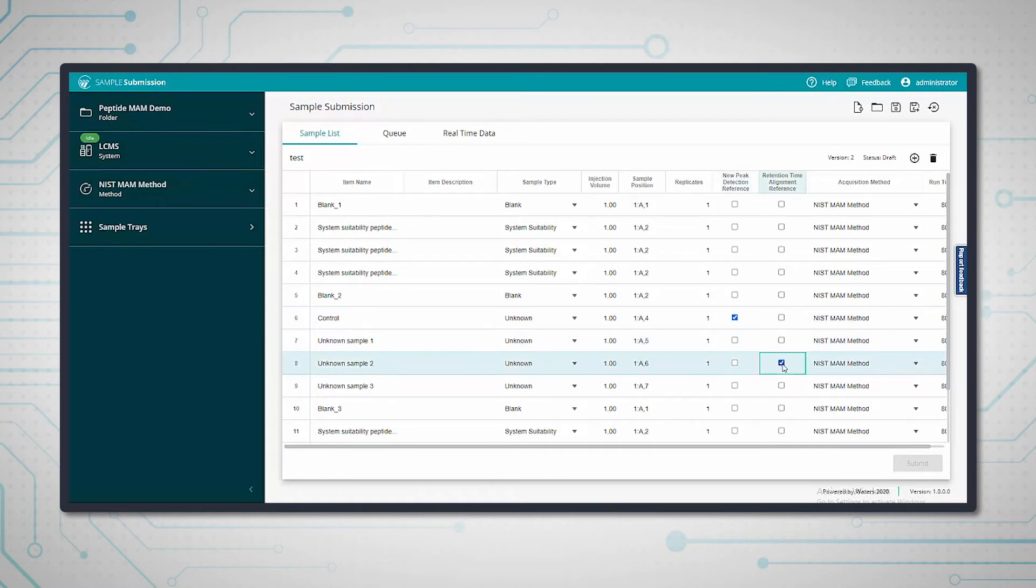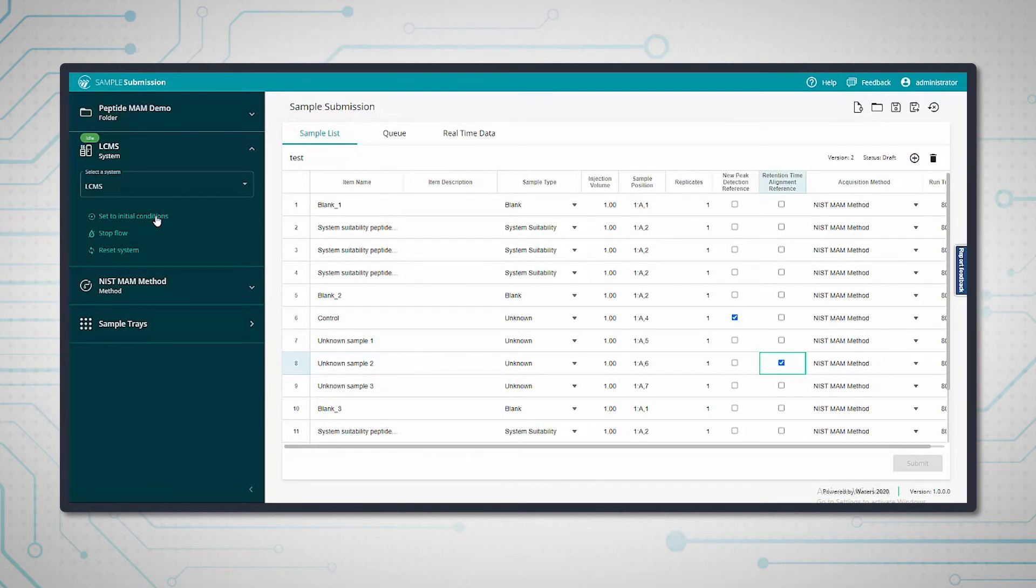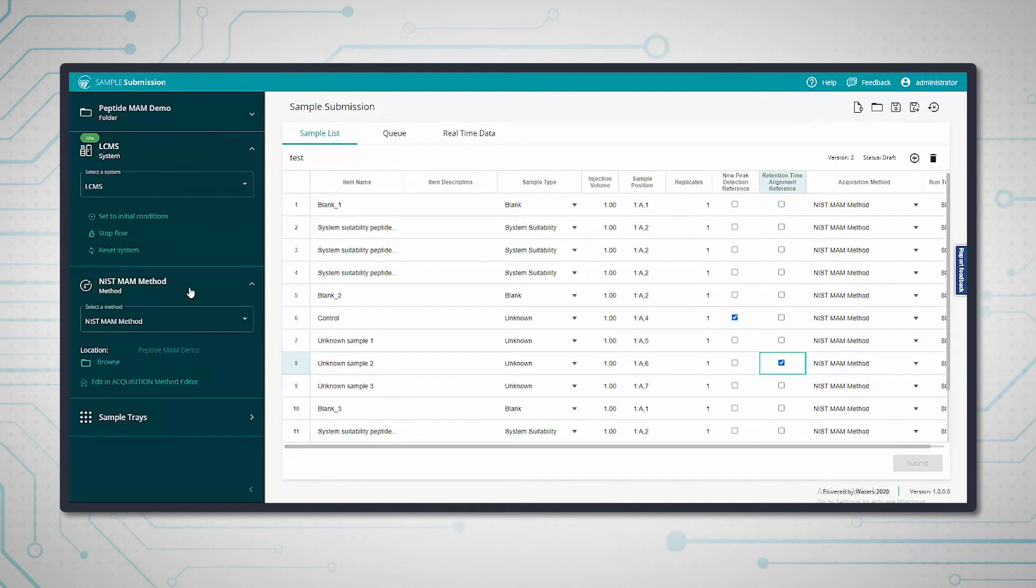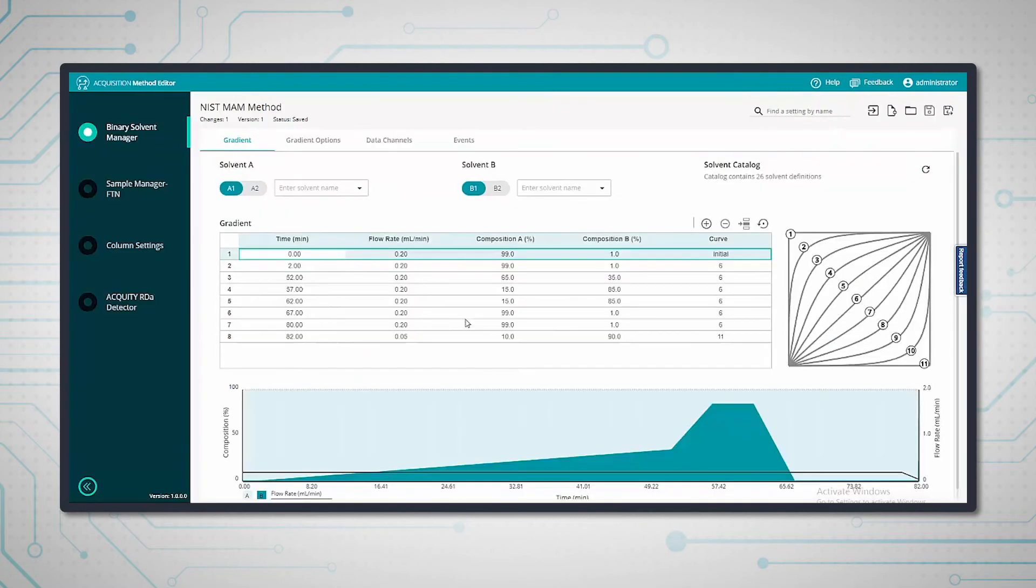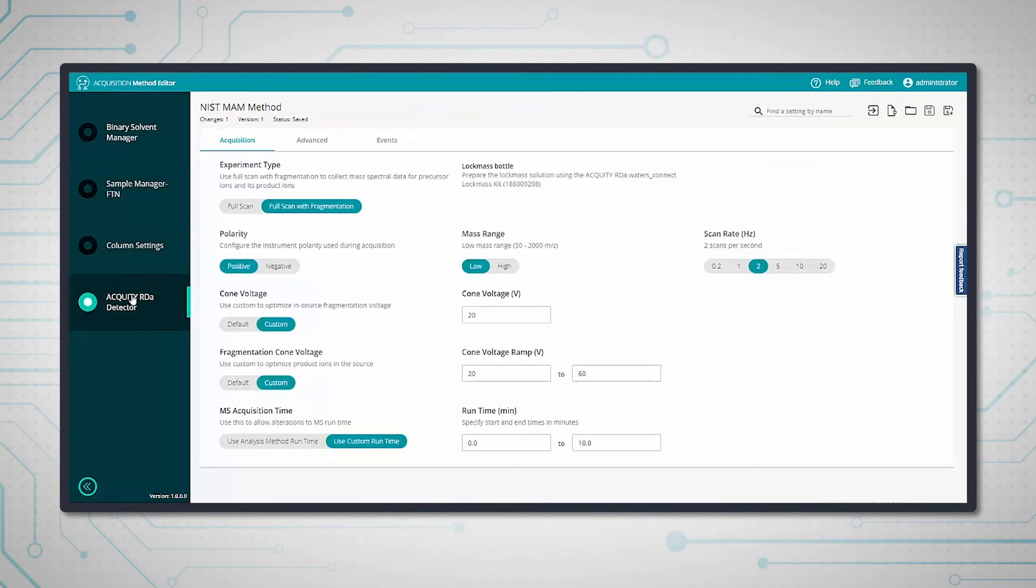On the left here, we have access to some instrument parameters. We can set the LC-MS to initial conditions to start the flow and make sure everything's equilibrated. Here's the acquisition method, and if I click edit, it will open the method in the acquisition method editor, which is another app. We can see all the parameters for the BSM, including the gradient here.